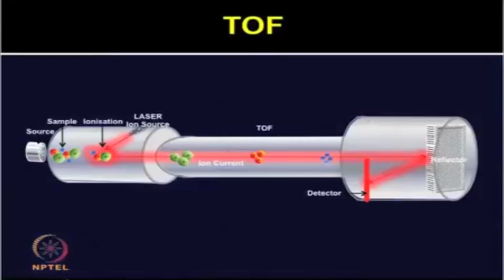In TOF, the ions are accelerated to high kinetic energy, and due to their different velocities, they are separated in a flight tube. One can also use a reflectron mirror, so that ions turn around into a reflector, which compensates for minor differences in kinetic energy and provides a longer separation.